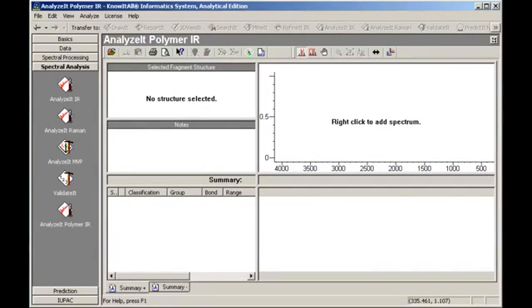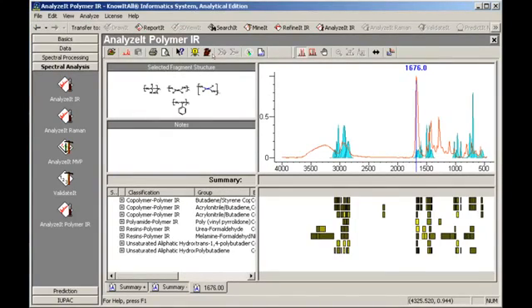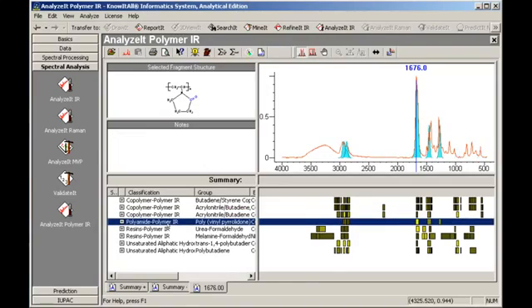Next, we will examine the spectrum from a single polymer compound. Click the Suggest a Peak toolbar button for possible starting points. Then click the Correlate toolbar button. Once again, we can examine the entries in the functional group data pane. This entry appears to be a good match.